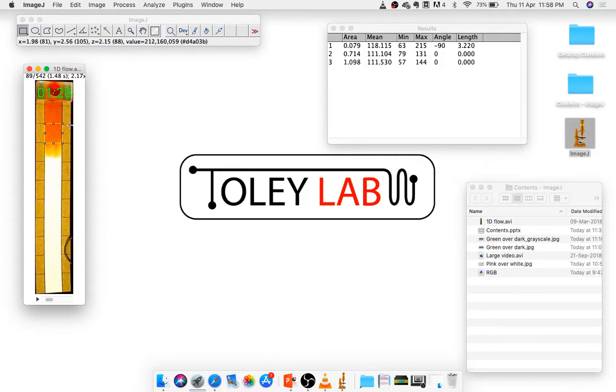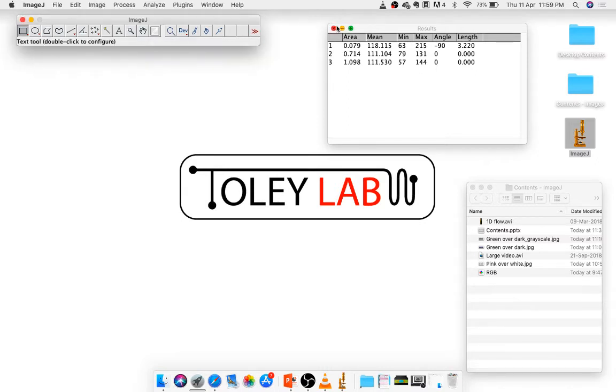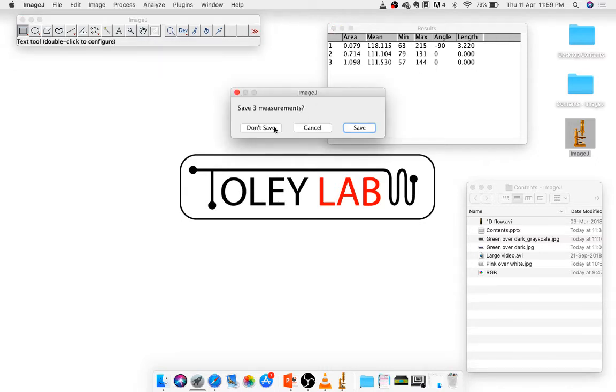The other thing is that the distance in here, by the way, if you look at the bar over here, when the scale is not set it shows numbers in pixels, but now it's perhaps showing both pixels as well as centimeters. So you can see here, just notice what occurs here. At any point, it shows me the distance in centimeters and the corresponding pixel. So this is a useful concept. Okay, that's all I'll say about measurements now.